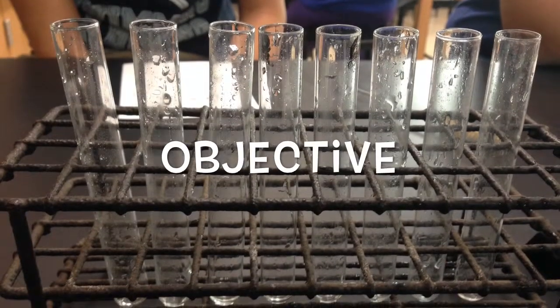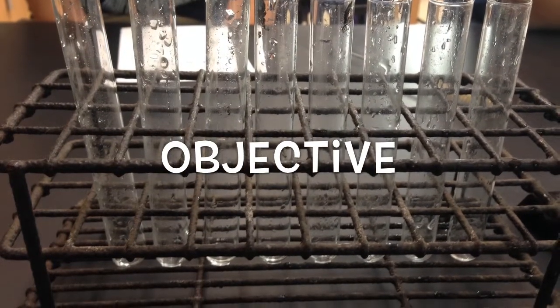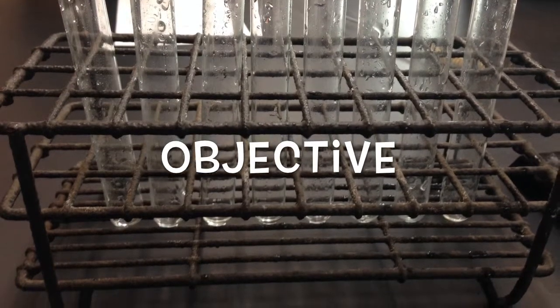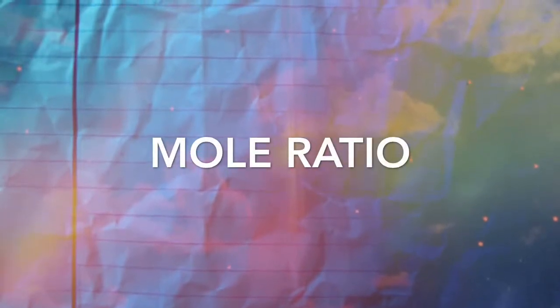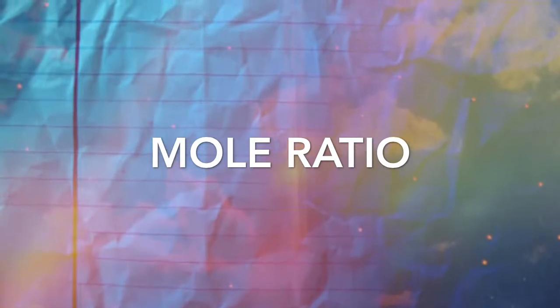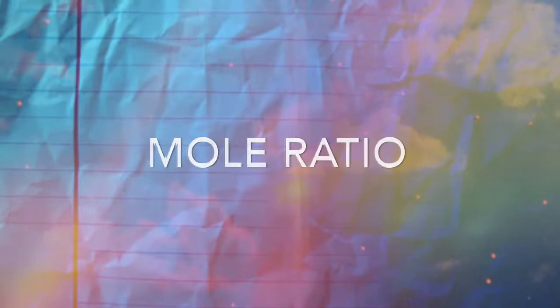We will observe the reaction between copper sulfate and potassium hydroxide at different ratios. The data will determine the limiting reagent at different ratios. It is possible to predict the amount of products formed if the balanced chemical equation is known. This relationship that exists between amounts of reactants and products is illustrated by a mole ratio.